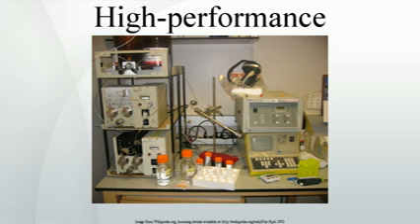The schematic of an HPLC instrument typically includes a sampler, pumps, and a detector. The sampler brings the sample mixture into the mobile phase stream which carries it into the column. The pumps deliver the desired flow and composition of the mobile phase through the column. The detector generates a signal proportional to the amount of sample component emerging from the column, hence allowing for quantitative analysis of the sample components. A digital microprocessor and user software control the HPLC instrument and provide data analysis.